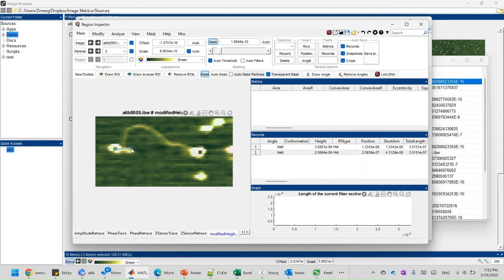I don't really care. In this case, it's really hard. It's definitely not going that way, because that way it doesn't go through the protein at all. We have limited information in this image to determine its exit direction and entry direction. This is just our best guess scenario.